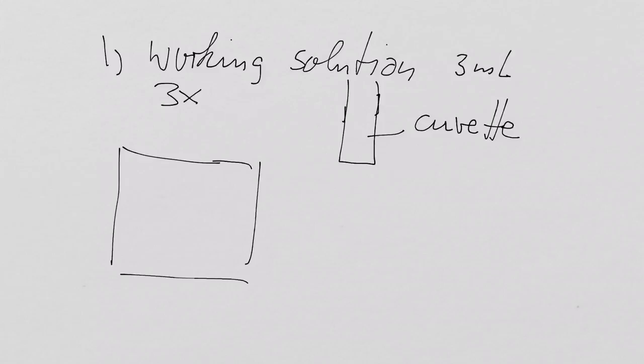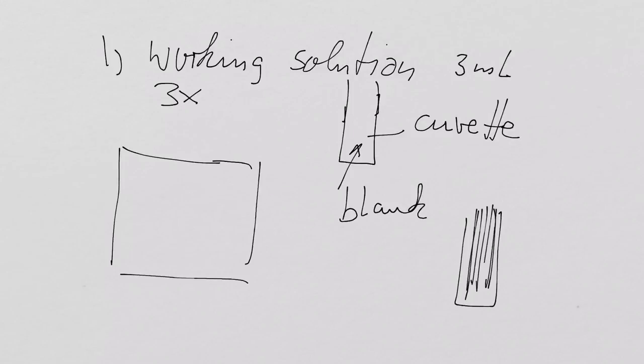So that's a cuvette. A cuvette is just a plastic receptacle that has a standardized format. Usually a cuvette has a blank side and also a side that is not blank, which looks a little bit like that. You can only touch a cuvette on the non-blank side. Don't touch it on the blank side, on the clear side.